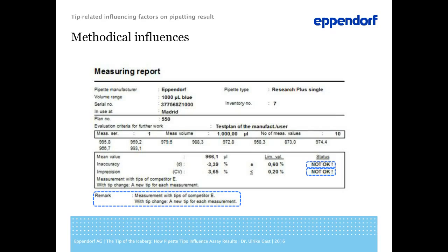The random error or imprecision describes deviations which are not systematic, or in other words, deviations which occur with changing conditions like by the user, by temperatures or temperature changes, or varying tip quality. Knowing this, guess what happens if person A pipettes a reaction setup with tip change. On the next day, person B works on the same analysis but without change. So you will probably get differing results then.